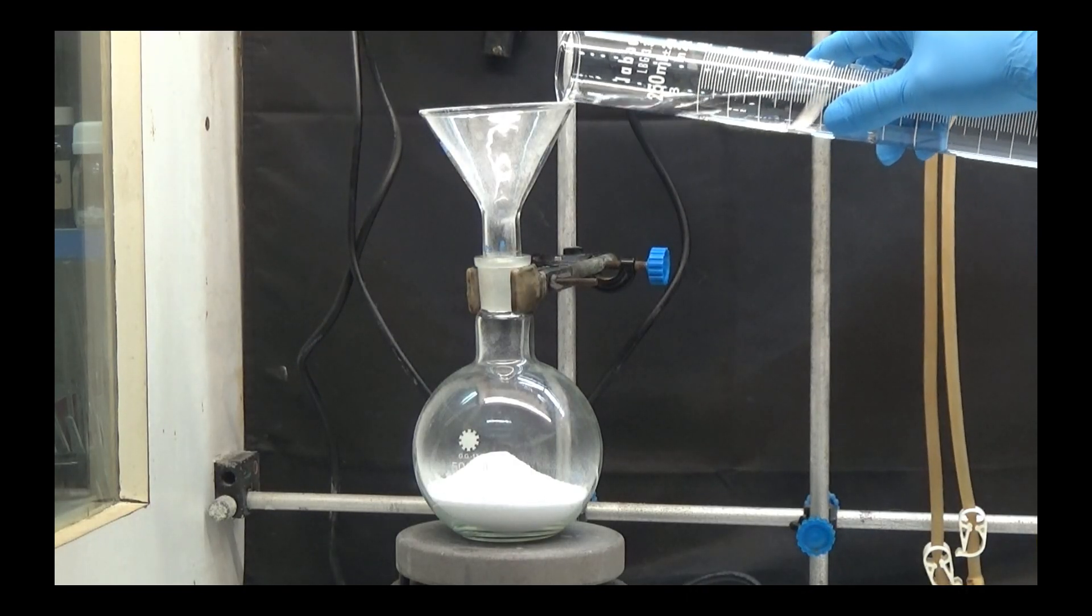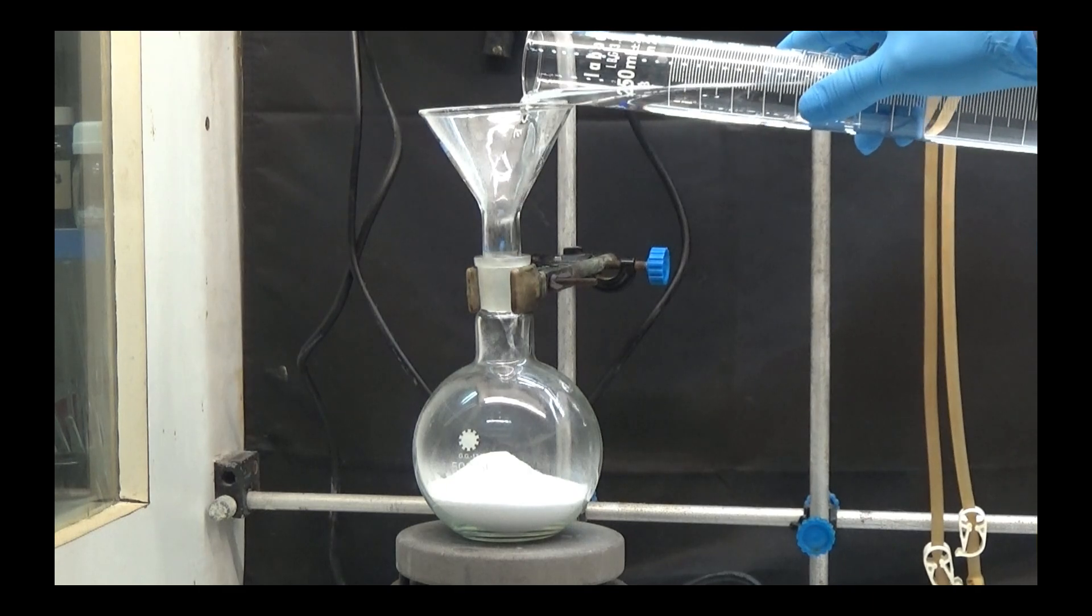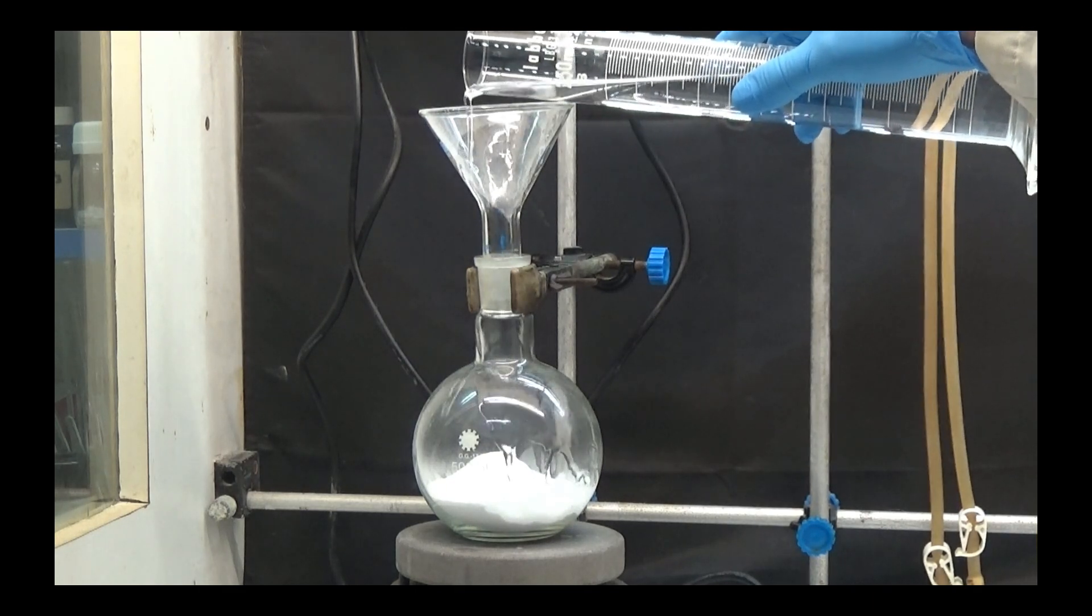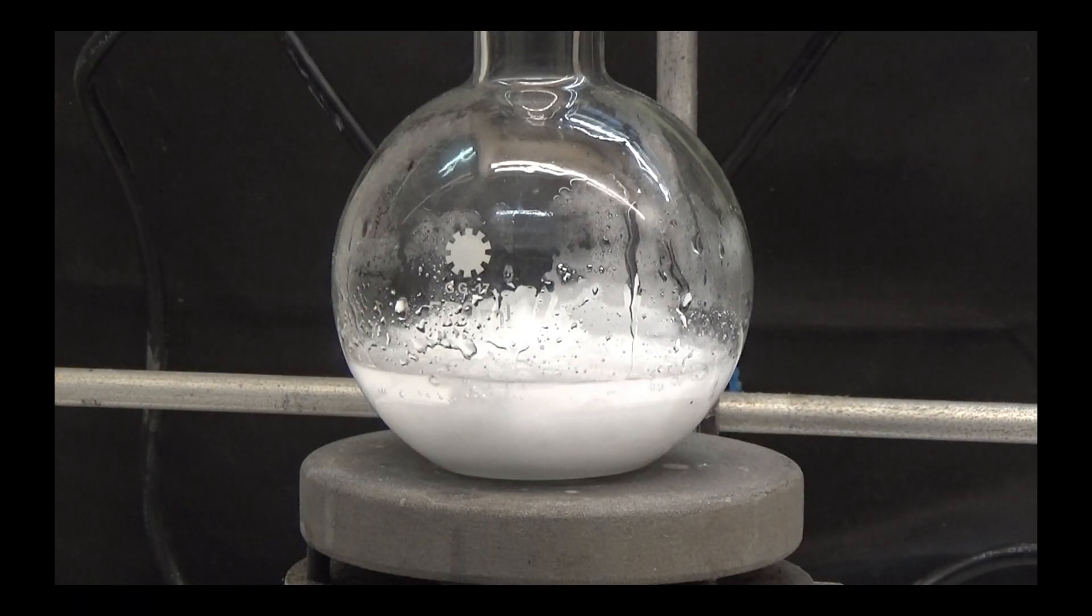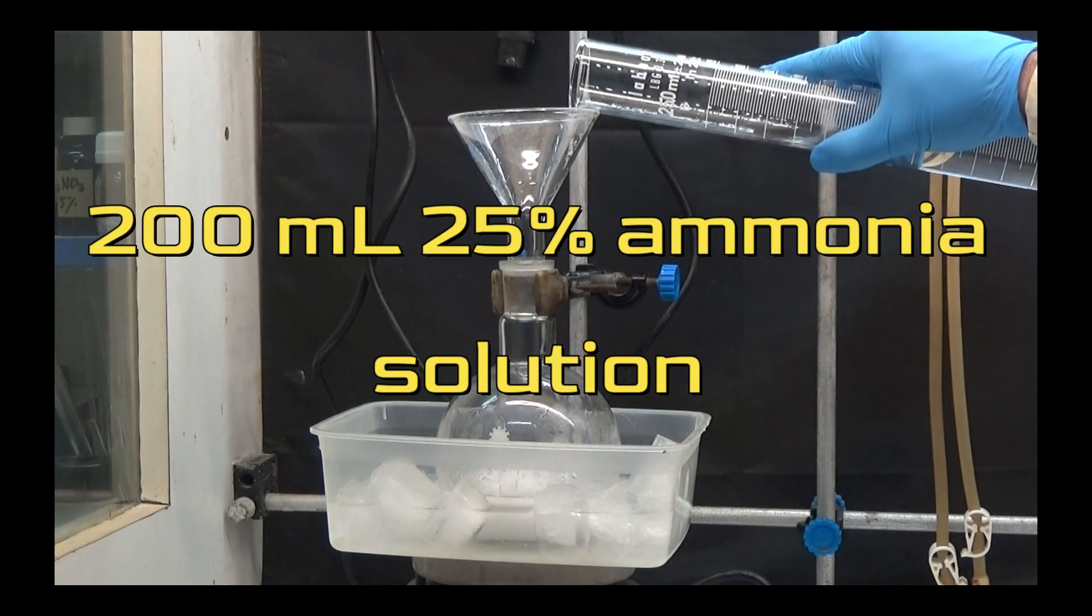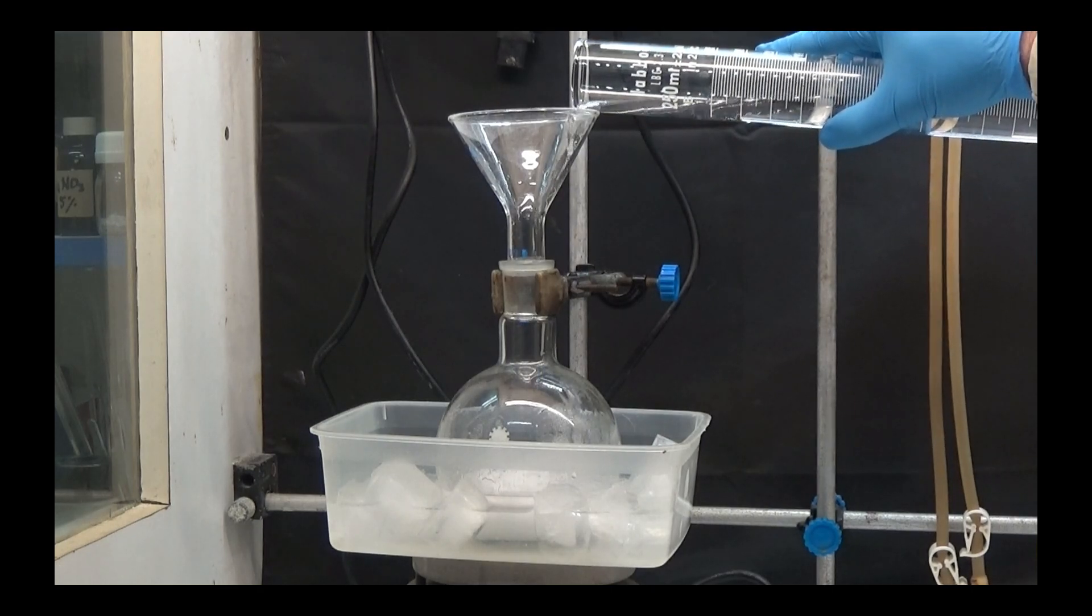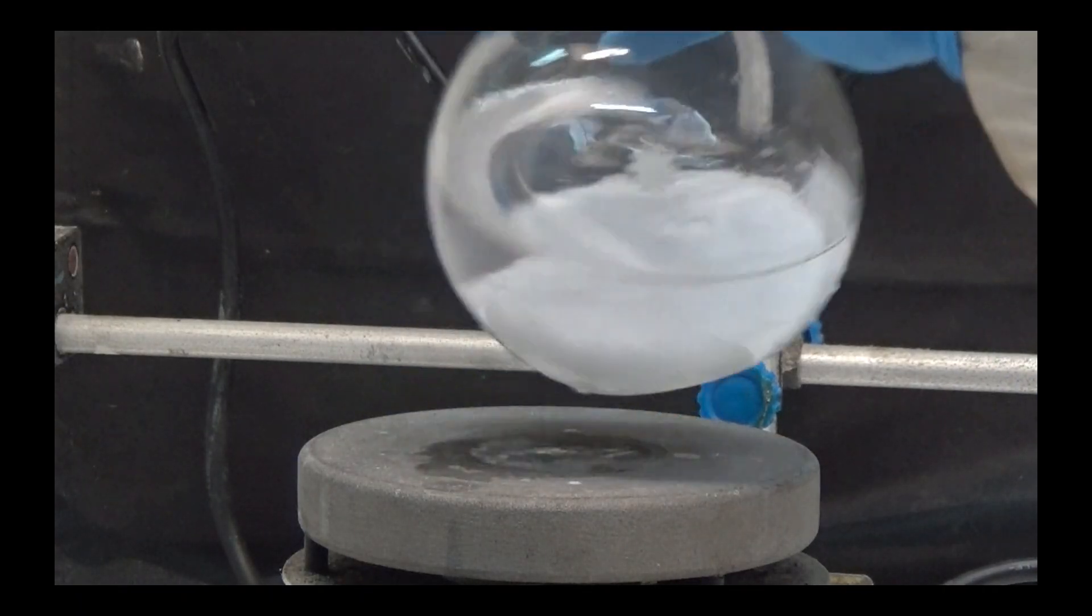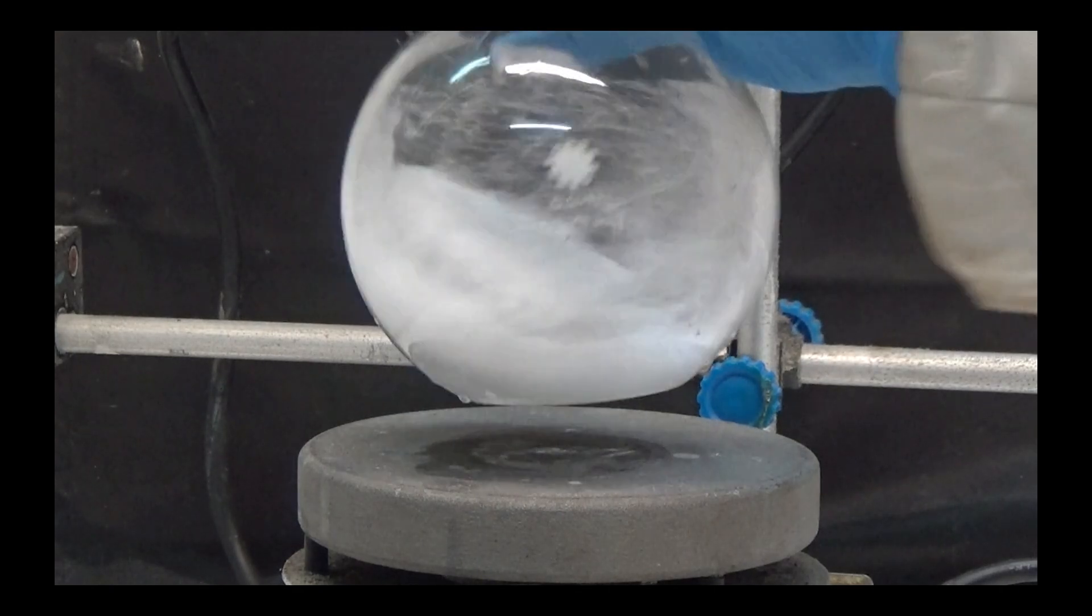We slowly add 25% ammonia solution and observe a reaction and increase in heat. To avoid a violent reaction, I immerse the flask in an ice water bath and slowly add 200ml of a 25% ammonia solution while stirring. Stir for a short time until most of the acid is dissolved.